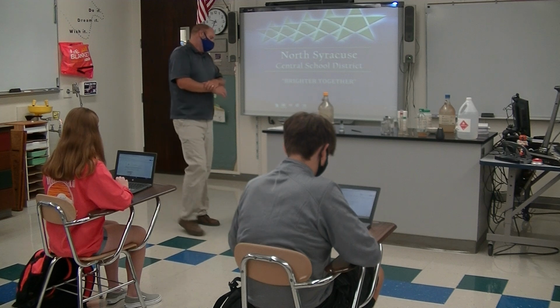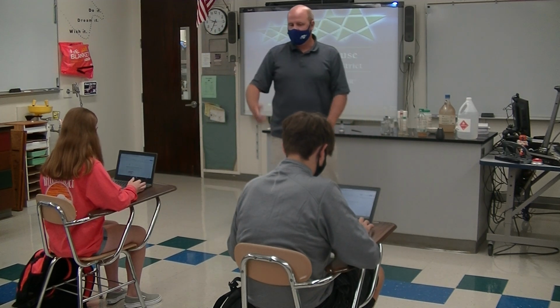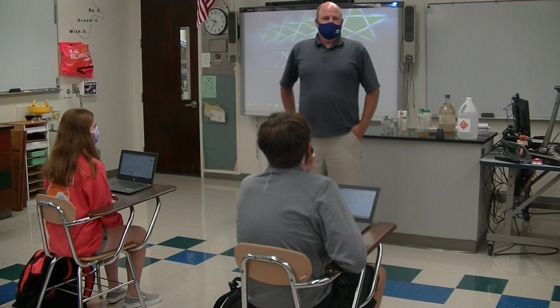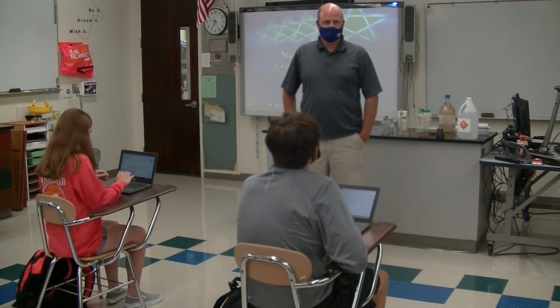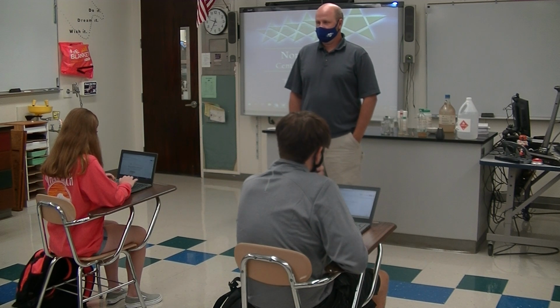Now, remember I told you the most dangerous person is the person who's near you, correct? So let's say you're sitting at a lab bench, someone walks by and they trip and throw acid down the back of you. What do you do? So you got concentrated acid down the back of you, shirt, pants, and such. What do we do? Suggestions.